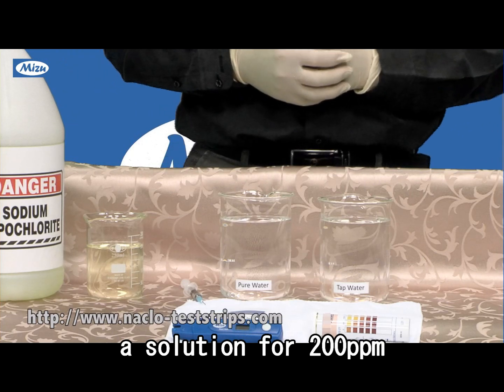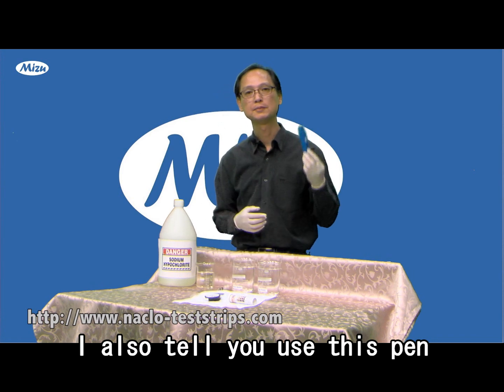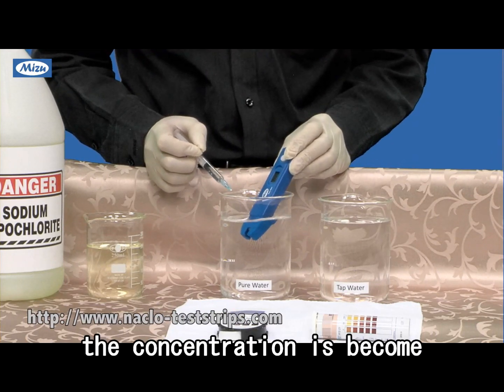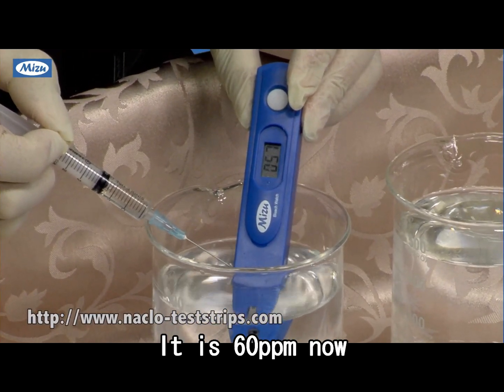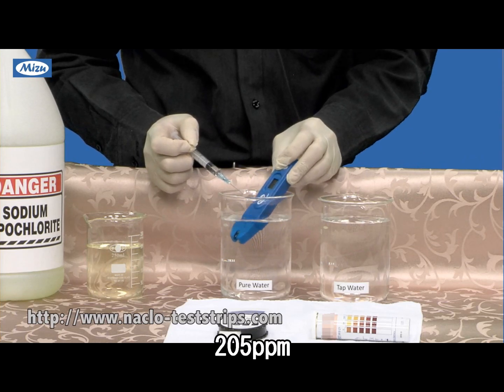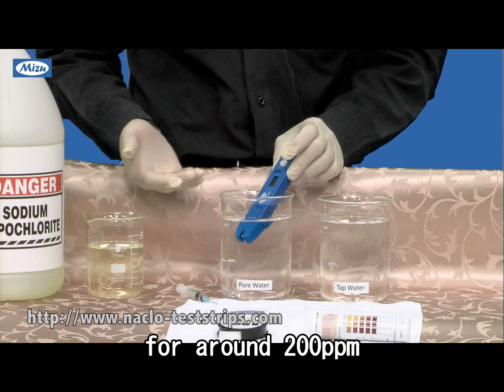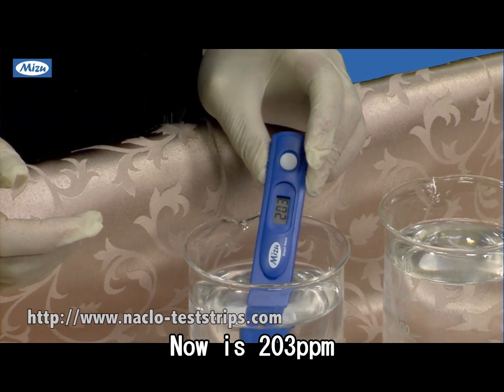If you want to prepare a solution for 200 parts per million ppm, I also tell you — use this pen and add the sodium hypochlorite. You will see the concentration becoming higher and higher: it's 60 now, 185, 205. That's the number I want — I want to prepare a solution for 200 ppm, around plus or minus 2%. Now it's 203.